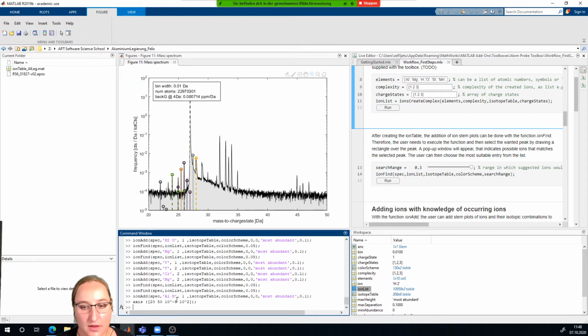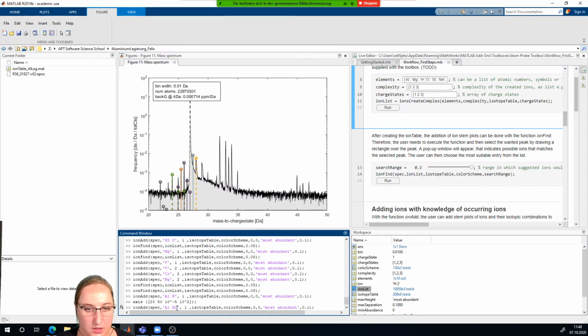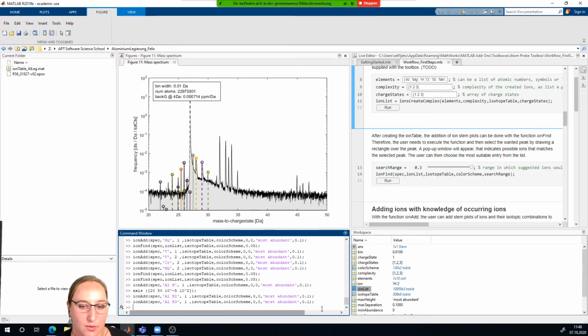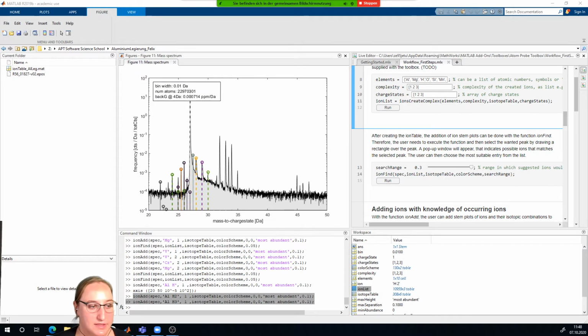Okay, the other one, maybe it's aluminium hydrogen 2. And the third, the really small one, could be 3. But that's really, we don't know it. In this case, we have to do more investigation, but in general, ranging a mass spectra is not that easy. And it's really depending on also what you want to see.